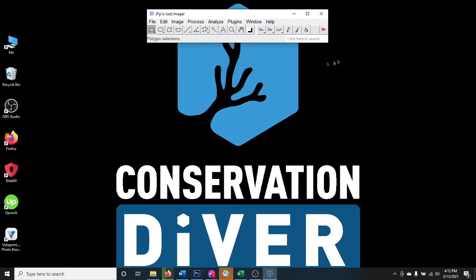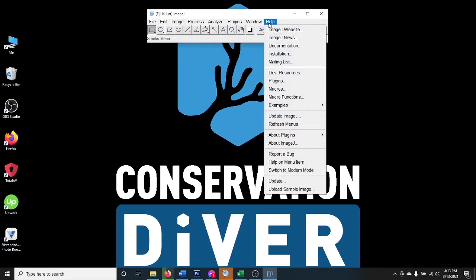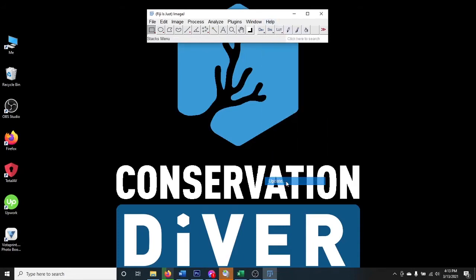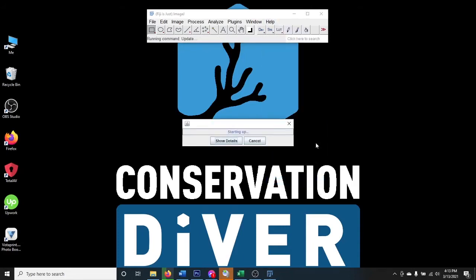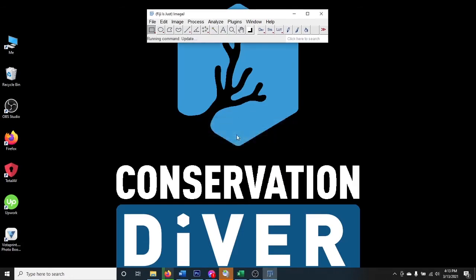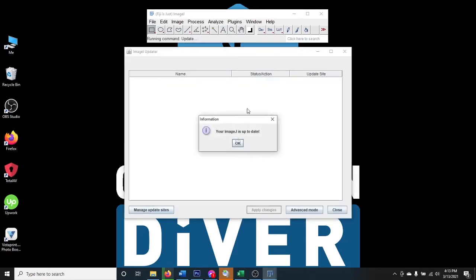Once you open up ImageJ, all you're going to get is this little toolbar — it's quite simple. You've got these different tools here. The first thing you want to do is go to Help, scroll down to Update, and update your version to ensure it's the latest. This will make sure that you have all the features that you need.